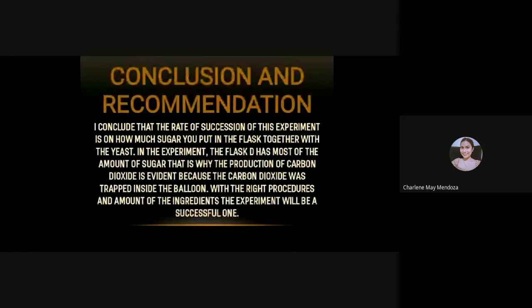We conclude that the rate of success of this experiment depends on how much sugar you put in together with the yeast. In this experiment, flask D has the most sugar. That is why the production of carbon dioxide is evident, because the carbon dioxide was trapped inside the balloon. With the right procedure and amount of the ingredients, the experiment will be a successful one.